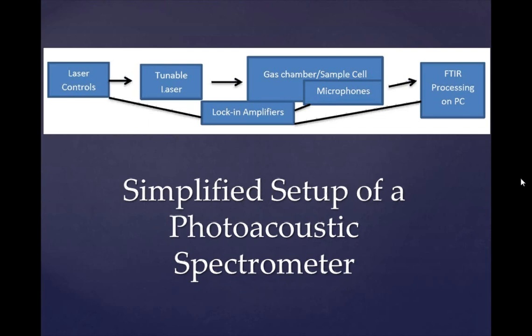As you can see, on the photoacoustic spectrometer there is a laser that shines into the sample holder. It can be directed onto a solid or liquid, or simply into the chamber of gas. Between the laser and the sample container, there is sometimes a spinning fan-like object that blocks light and then allows it to pass through repeatedly. This allows the analyte to expand and contract repeatedly to make the sound waves necessary.